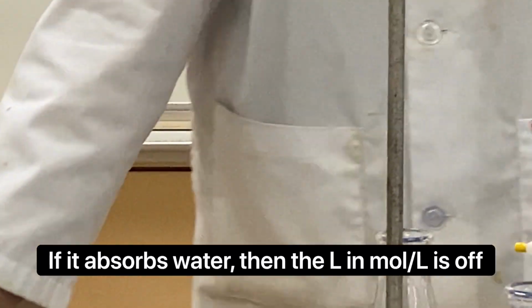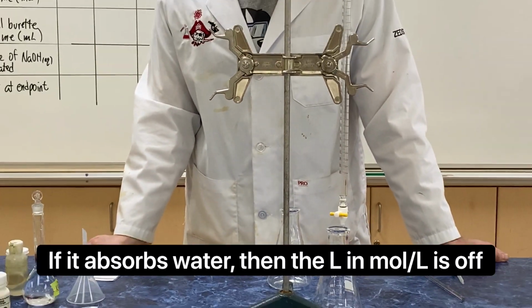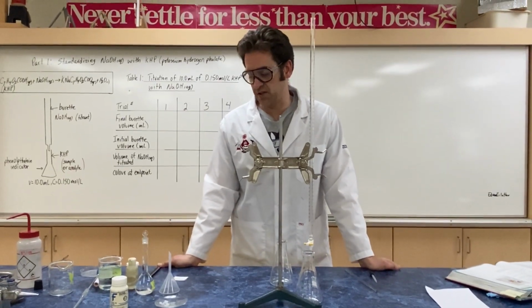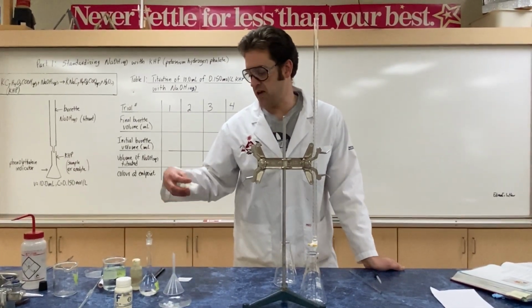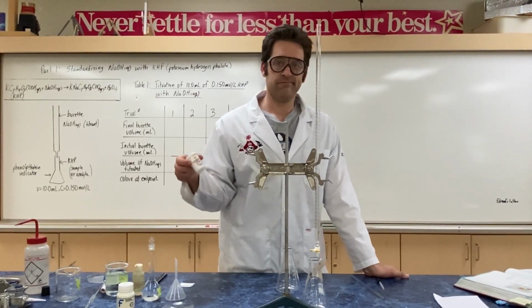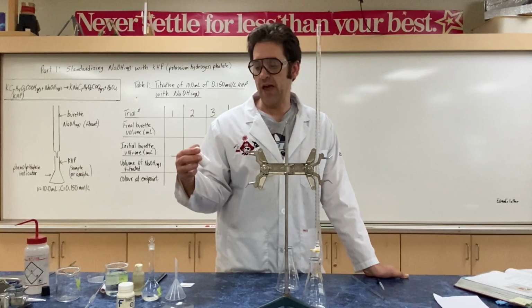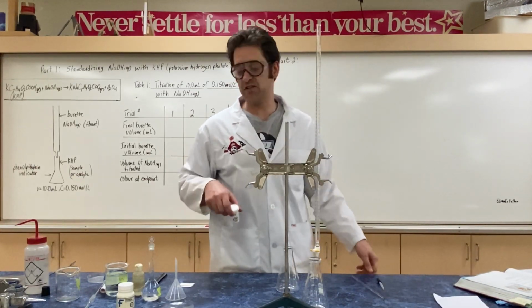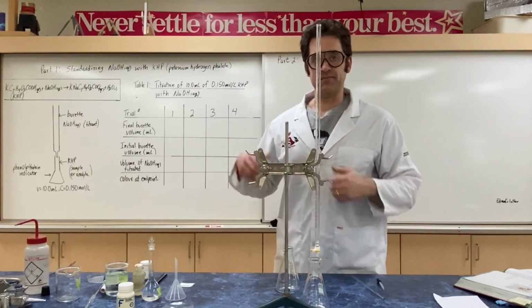So that means if we're mixing it, we can't be 100% sure what the concentration is. So we have to double check it with a known concentration of something else called KHP. And KHP, we can measure out and make a very accurate concentration. And Zdog's going to be up here right away to talk about the first technique to get this going with our burette system.